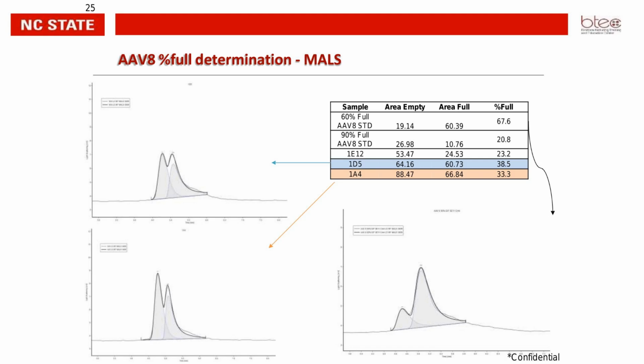We have gotten pretty good comparison, and we feel that this method is very reliable. Also, looking at some of the initial presentation by Blaž, we can say that it is a very exciting method because they are developing it to quantify the percentage of fulls in the feed sample, which is again one of the most challenging things to do here.